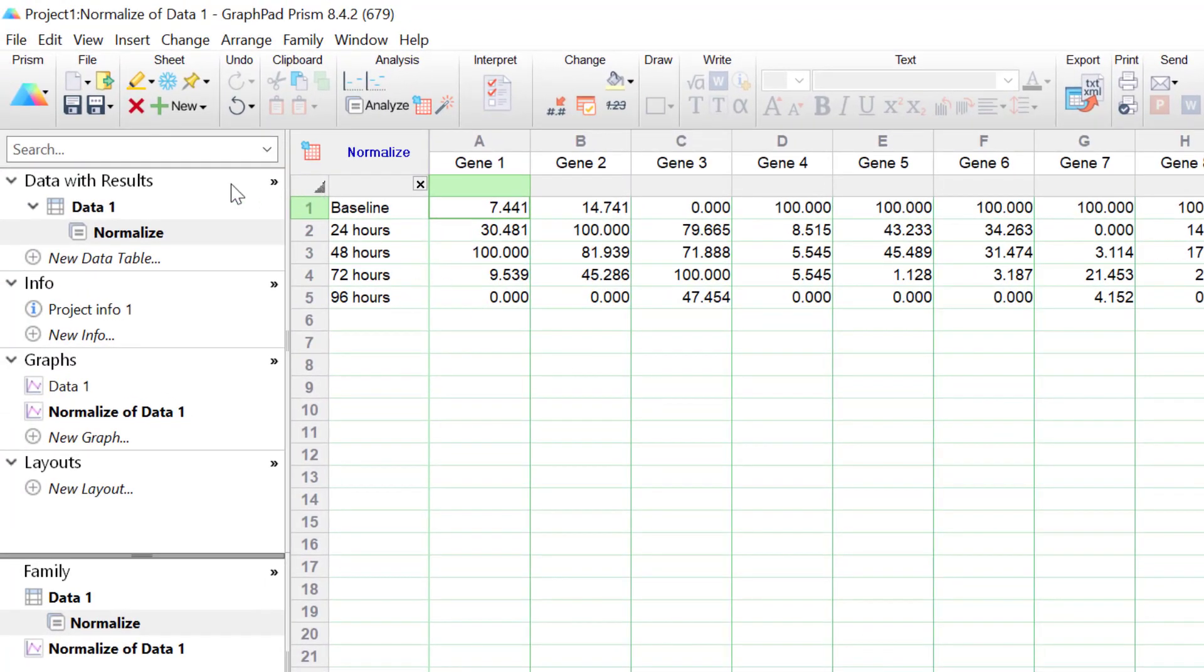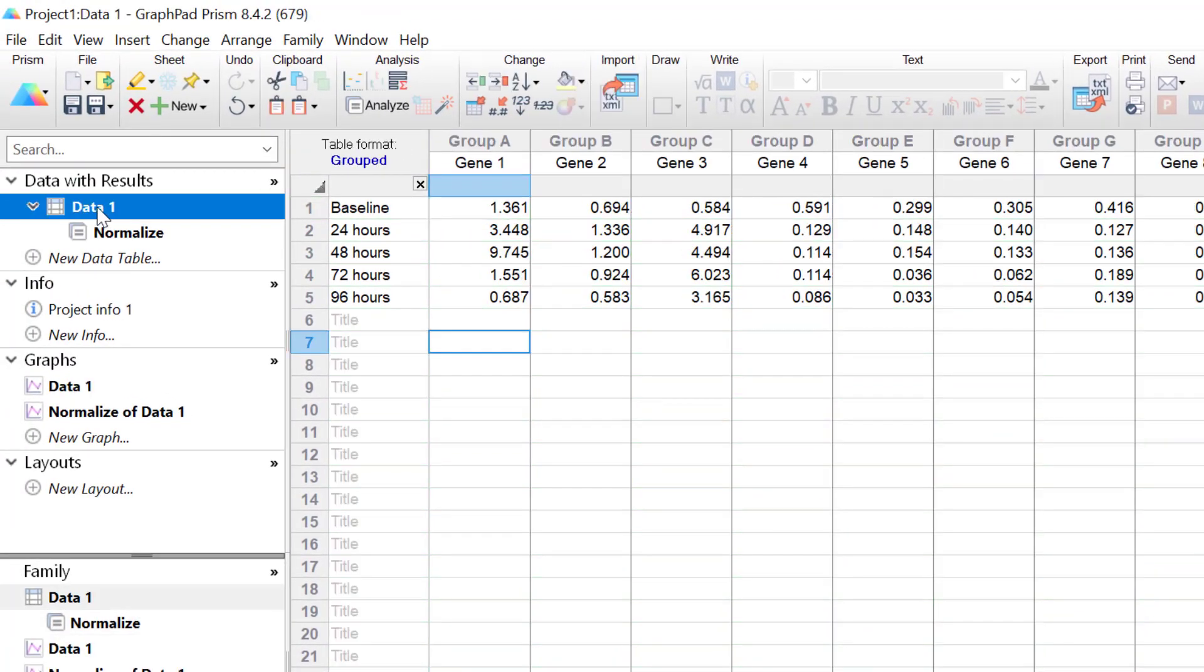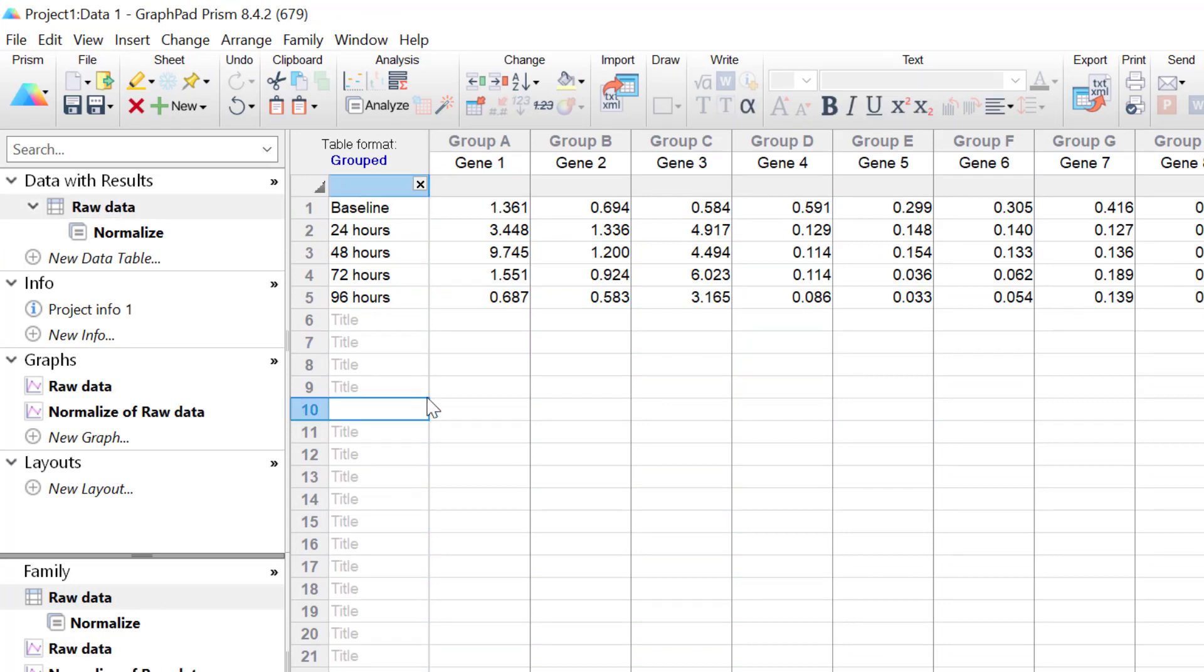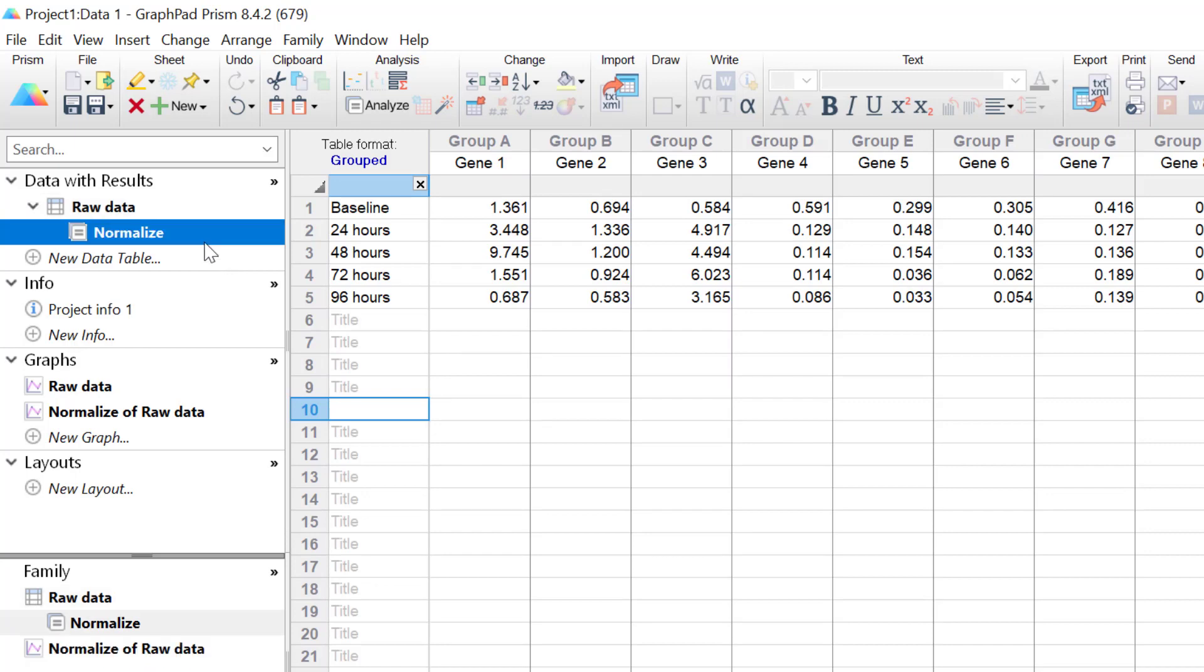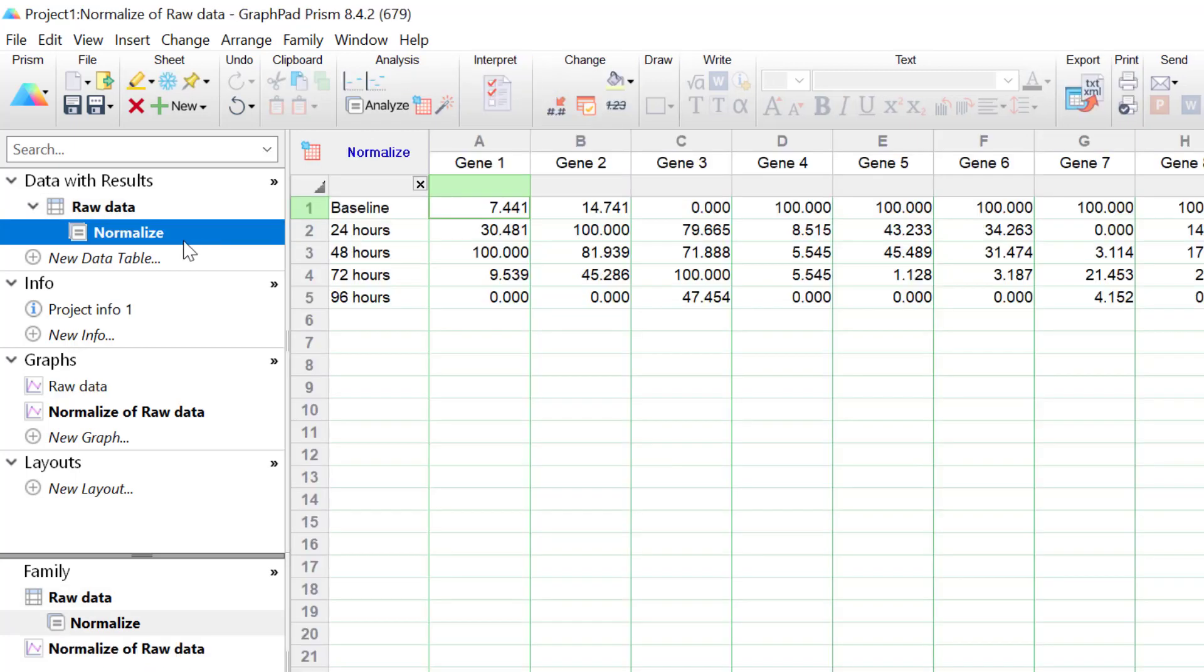What I'm going to do quickly is just change the name of my first data sheet to be RawData, just so we can differentiate between the two. So now under the RawData table there is now a new data table containing the normalised data. These values are now percentages and not gene expression values.